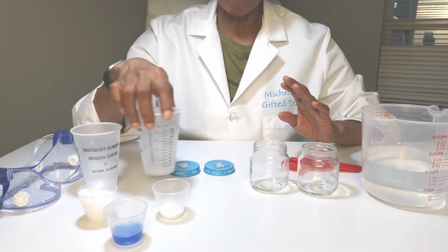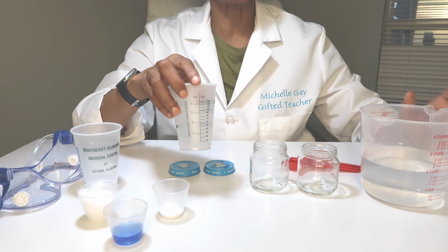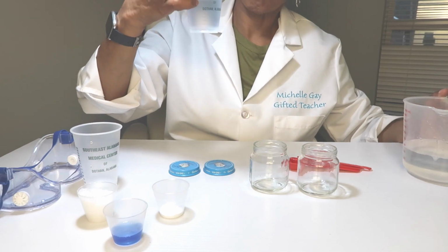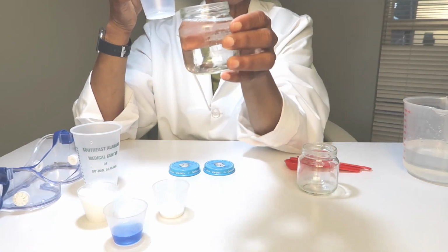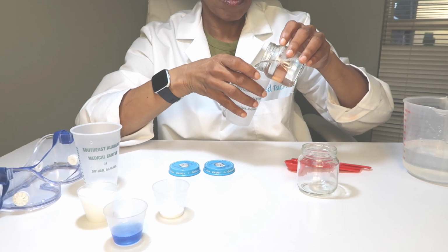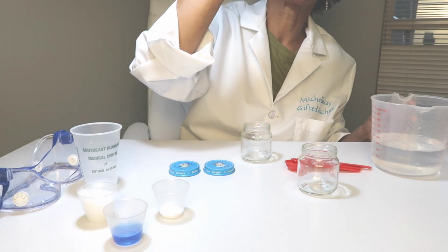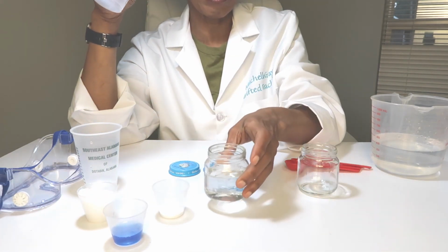All right, so let's look first at making our hard water. So you're going to need 100 milliliters of distilled water, or you will need 3 ounces. We're going to pour that in one jar. Now, this jar is small, so what I'm going to do is take half of it out. We're going to put 50 milliliters of distilled water. If you have a larger jar, you can use more. There we go. That's much better. So we're going to do 50.